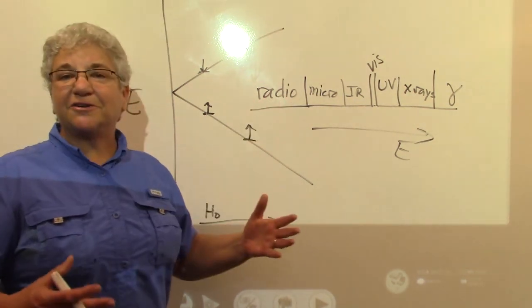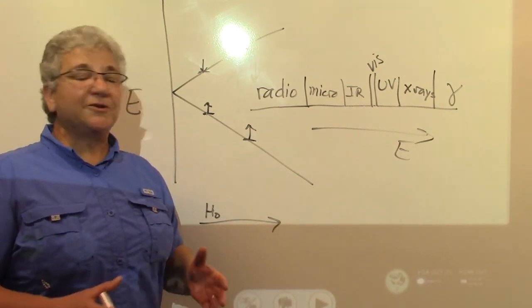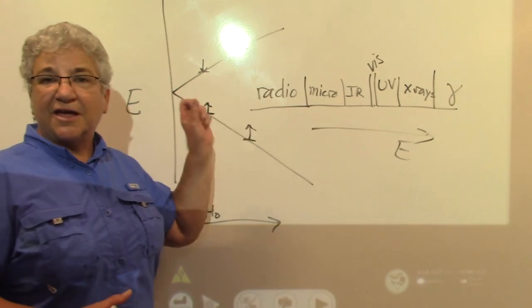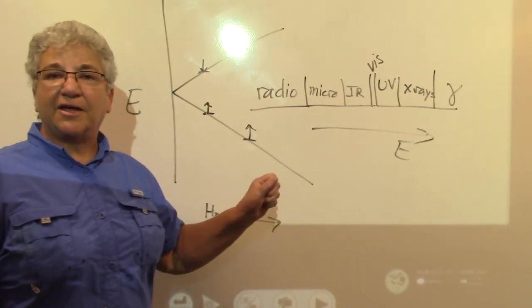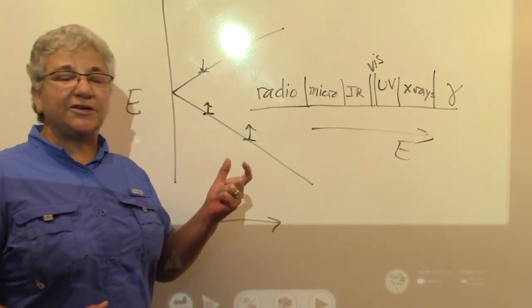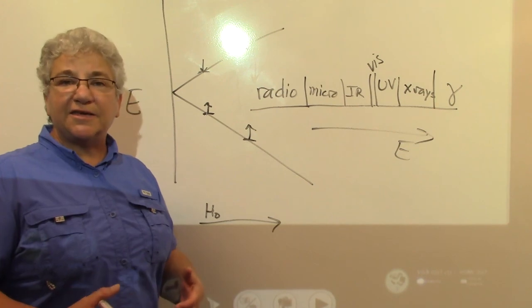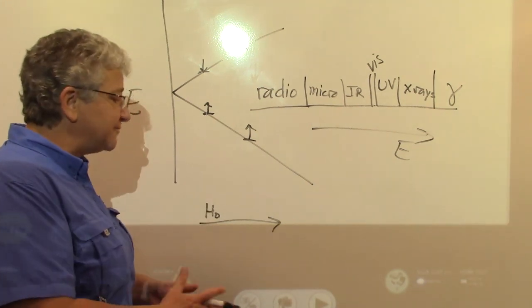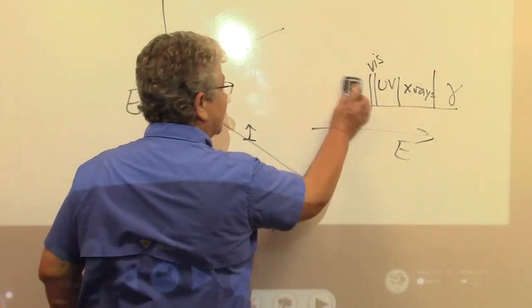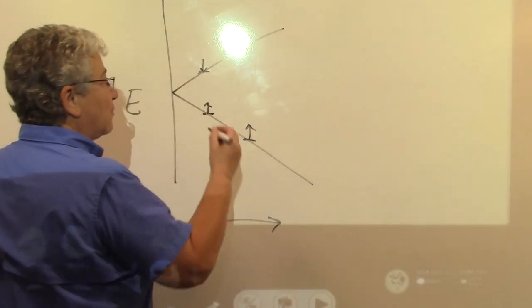But that's all the energy we need for our NMR to give us decent data. So it's these frequencies that we're firing at your sample. And that low amount of energy is all that your nuclei need to do what's called a spin flip.